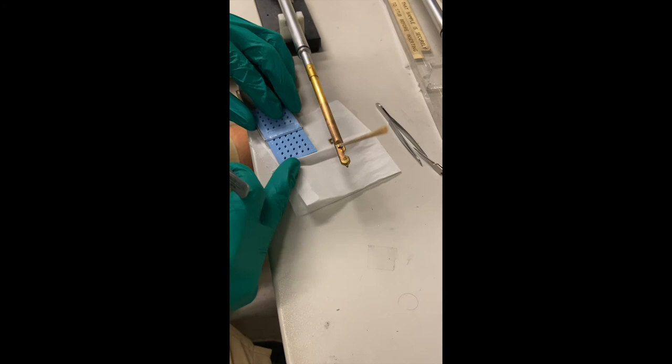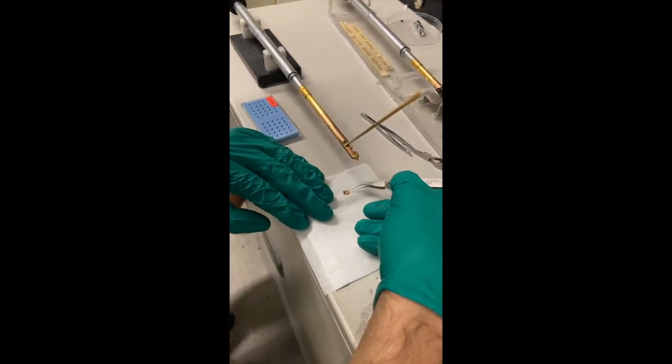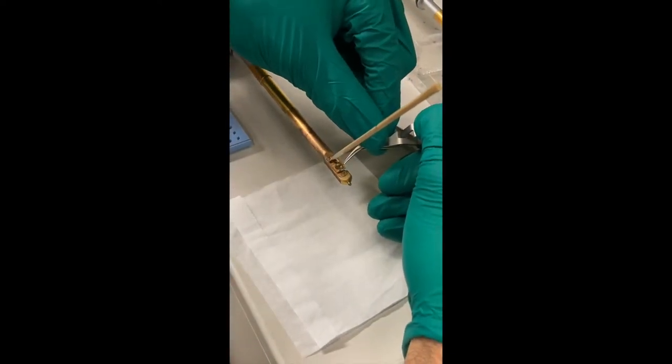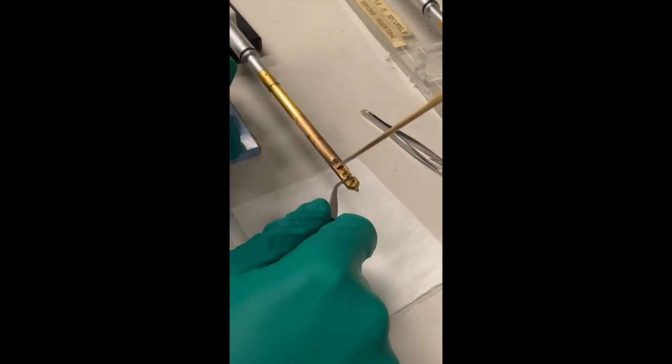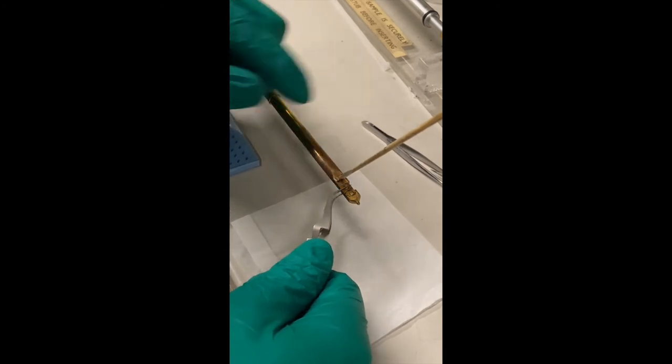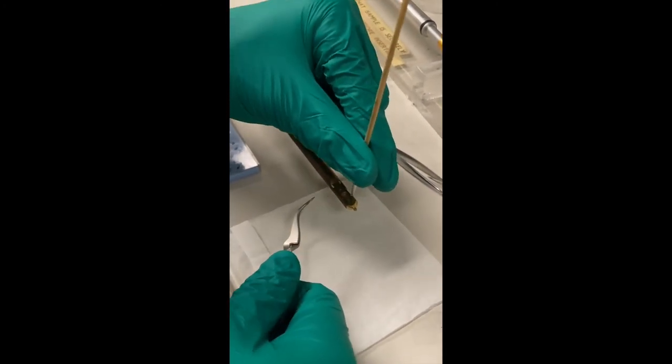Now that we know about how the instrument works, let's run a sample. The first thing that we need to do is load our sample into the instrument. In order to do this, we have to put our grid in a special sample holder that can slide into the vacuum chamber. Let's watch as I definitely don't screw this up and do multiple takes.